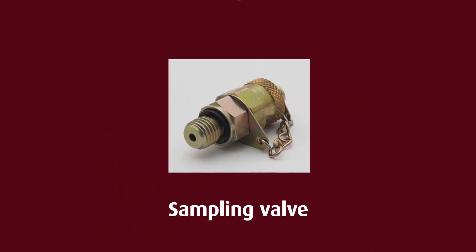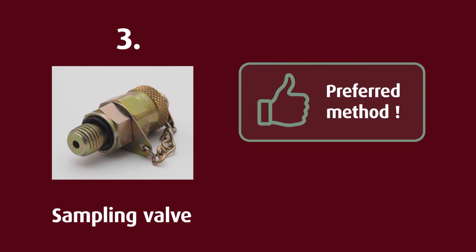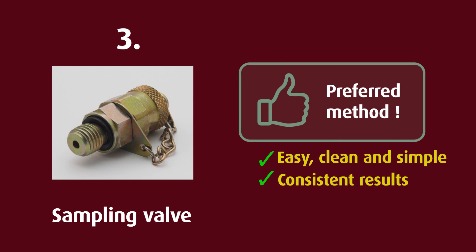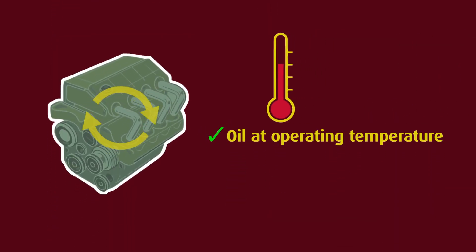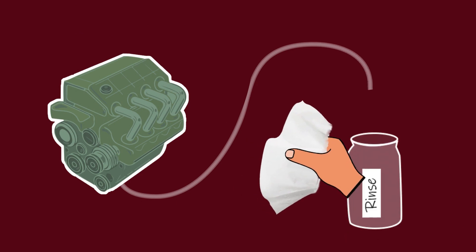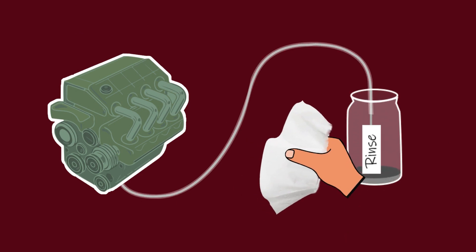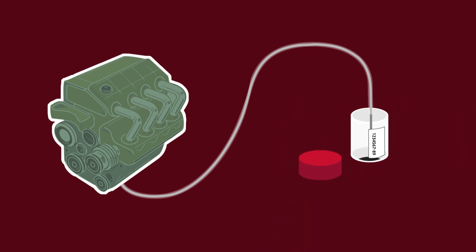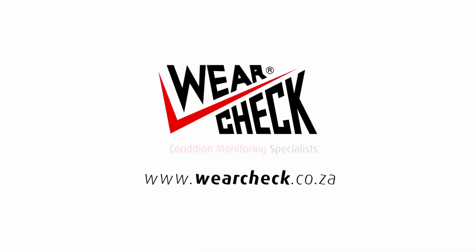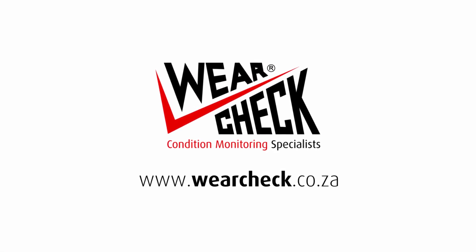Sampling valve: the sample valve is the most reliable method for taking a sample. It is easy, clean, and simple, and provides consistent and representative results, as the machine has to be running for the valve to work and the sample will always be taken from the same location. Make sure that the oil is at operating temperature to ensure it is well mixed. Remove the dust cover, clean the valve orifice, and attach the connector. Allow a few milliliters of oil to drain into the rinse bottle in order to purge the sampling tube. Disconnect the rinse bottle and attach the sample bottle. Fill the sample bottle to about the ¾ level. We hope this has been helpful — if you have any questions, please do not hesitate to contact us.